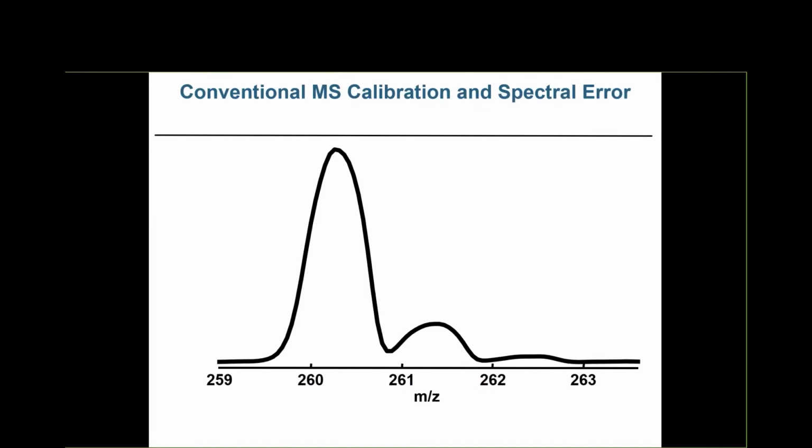If we try to do the same thing with mass spec, we can't do that because the line shape is really unknown. It's undefined. It's really a function of the tune. And that's a shame because if we did know what the physics of the underlying line shape was, we could use that to more accurately model these isotope profiles. And that's the thing that we call spectral accuracy.